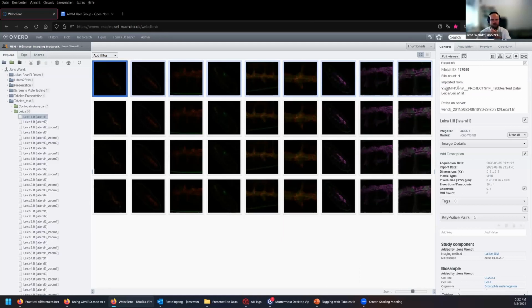Yeah, I'm fully aware of that. But you can set up, if you always move it in the same folders, the same structure. If you have the same structure on the microscope workstation and on your file share, you can set up a synchronization rule in Tables that basically cuts the path before and just pretends everything.